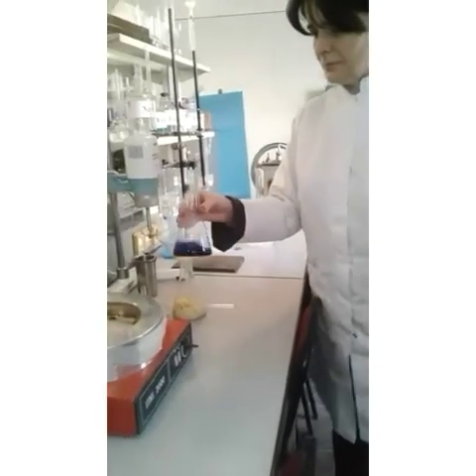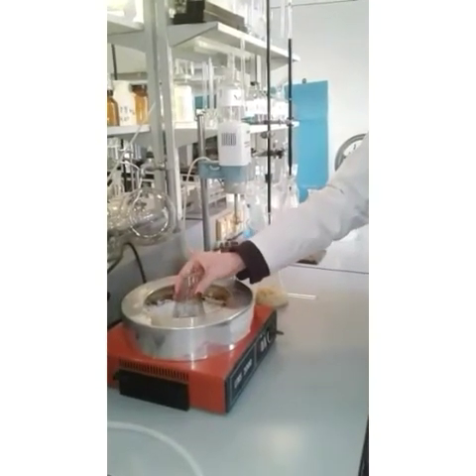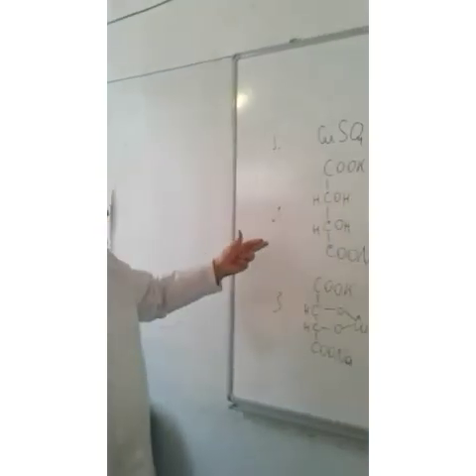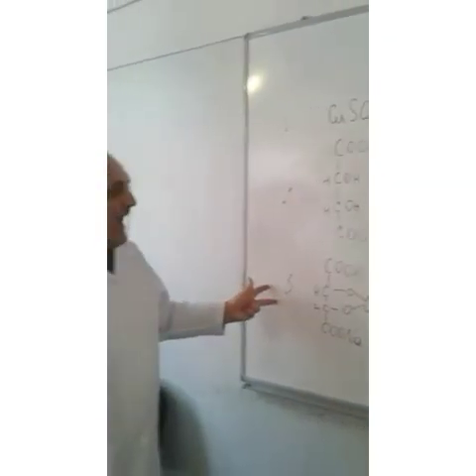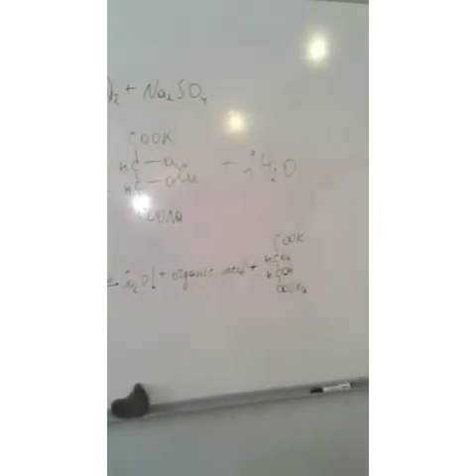Heat to boiling, and after the first bubbles appear, boil for 3 minutes. The first and second reactions occur when mixing Fehling's solutions, but the third reaction takes place after the filtrate is added to Fehling's liquid and heated.